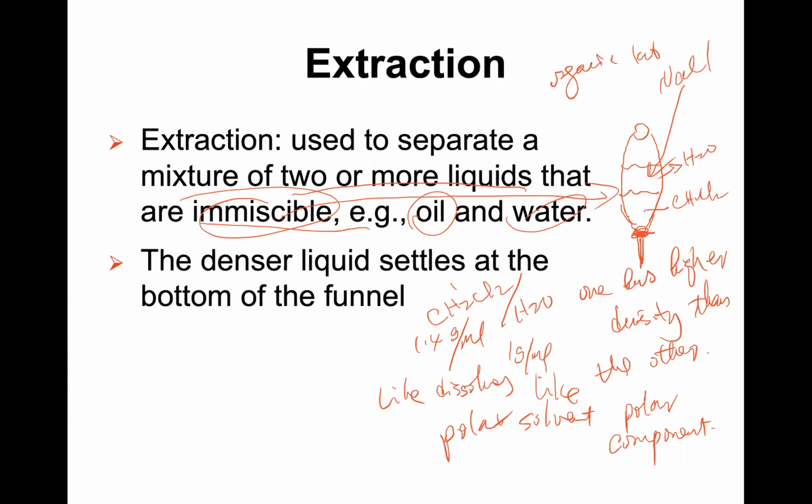Now the question is here. This one actually we can talk a lot about. For those two liquids here, we mentioned that not only are they not miscible, they will have different density. If their densities are similar, then you cannot separate them, right? And also both liquids have different refractive index. In this case, you can clearly see the boundary. If both liquids have the same refractive index, then you cannot see the boundary. Okay, so this is one way.